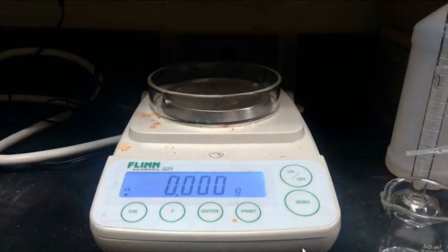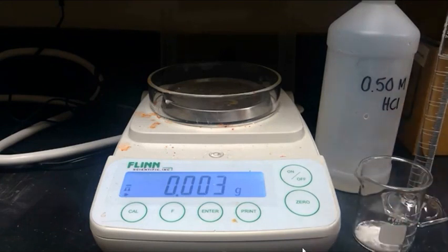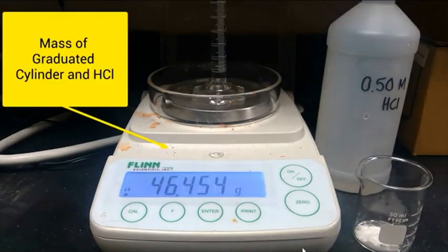Now that we have the mass of the beaker with the baking soda, we're going to measure out exactly 10 milliliters of hydrochloric acid using a graduated cylinder. I've already pre-poured some of that acid into the grad cylinder, so I'm now just going to add drop by drop until I get to that 10 milliliter mark on the meniscus. And I need to get the mass of the graduated cylinder with the hydrochloric acid. Be sure to record that.